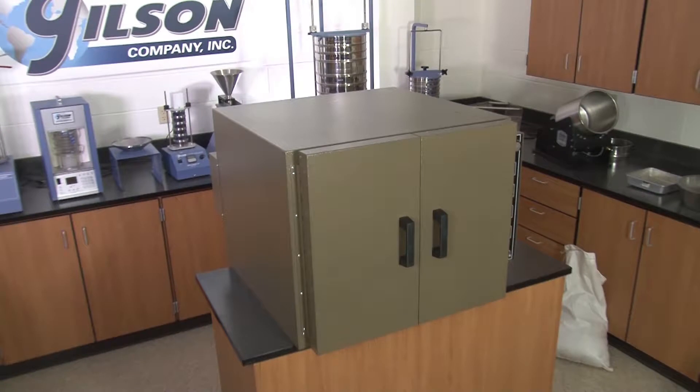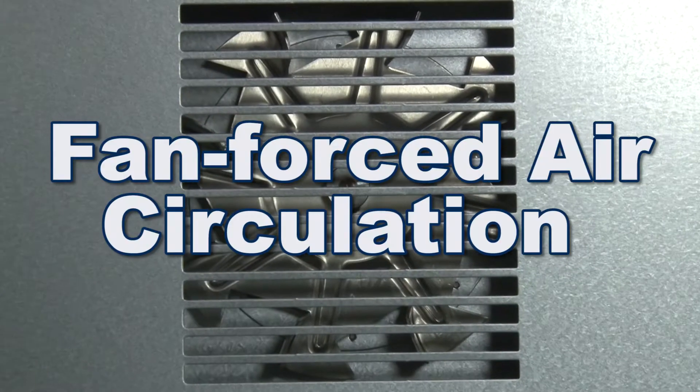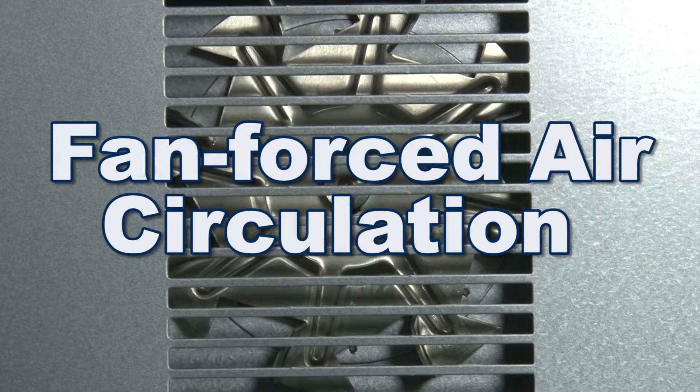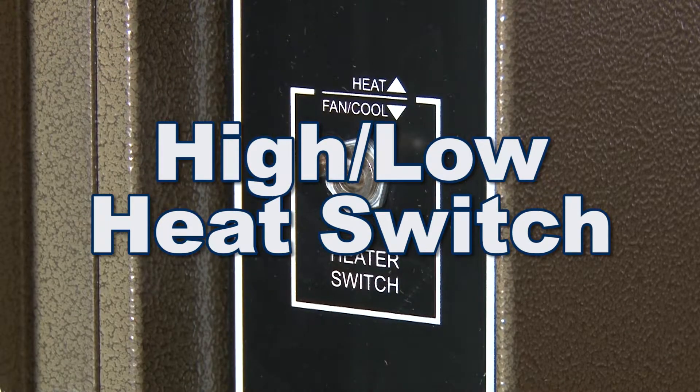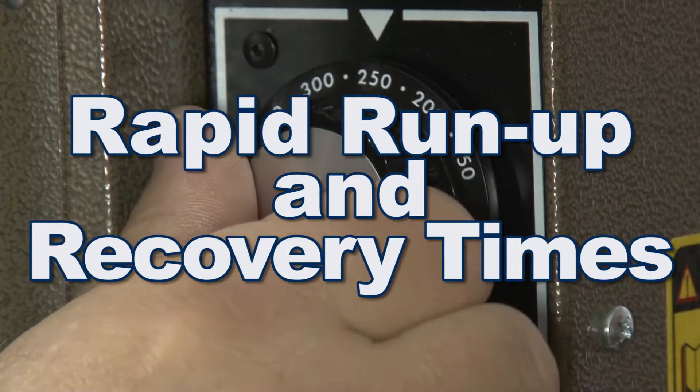Gilson offers a variety of Quincy Lab general purpose bench ovens, all with fan-forced air circulation for convection operation, 6-pound high-density mineral wool insulation, high-low heat switch, and rapid run-up and recovery times.